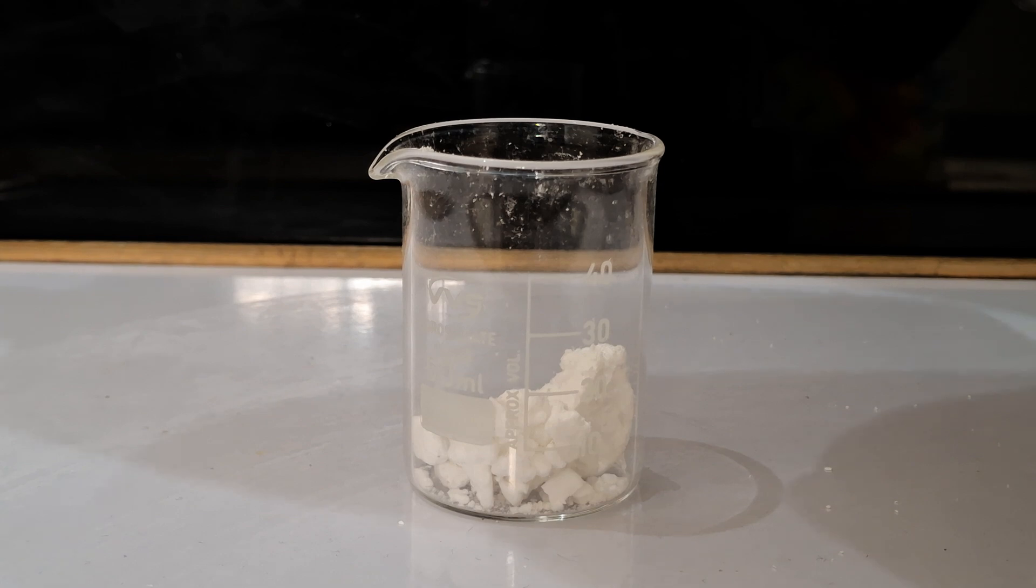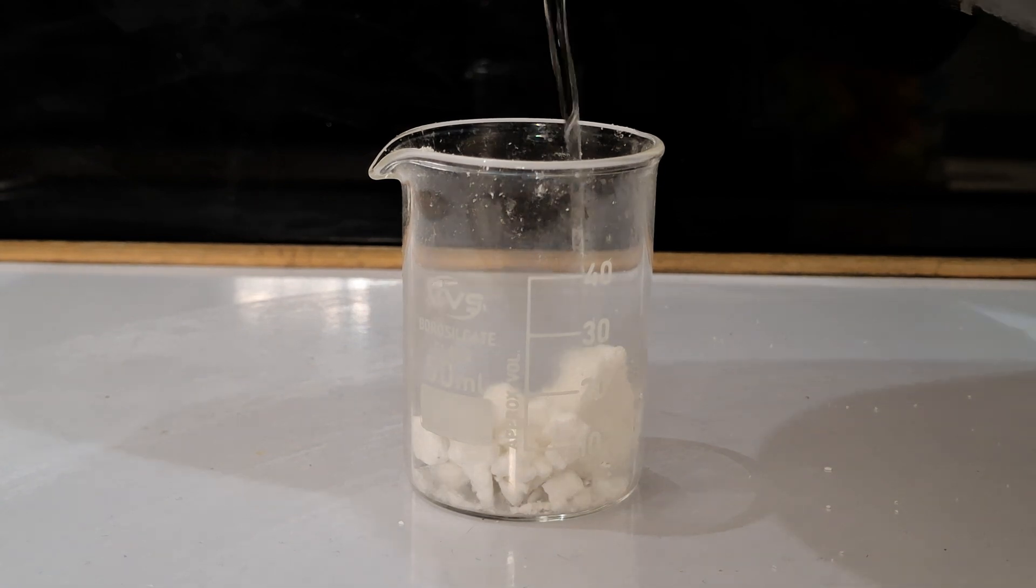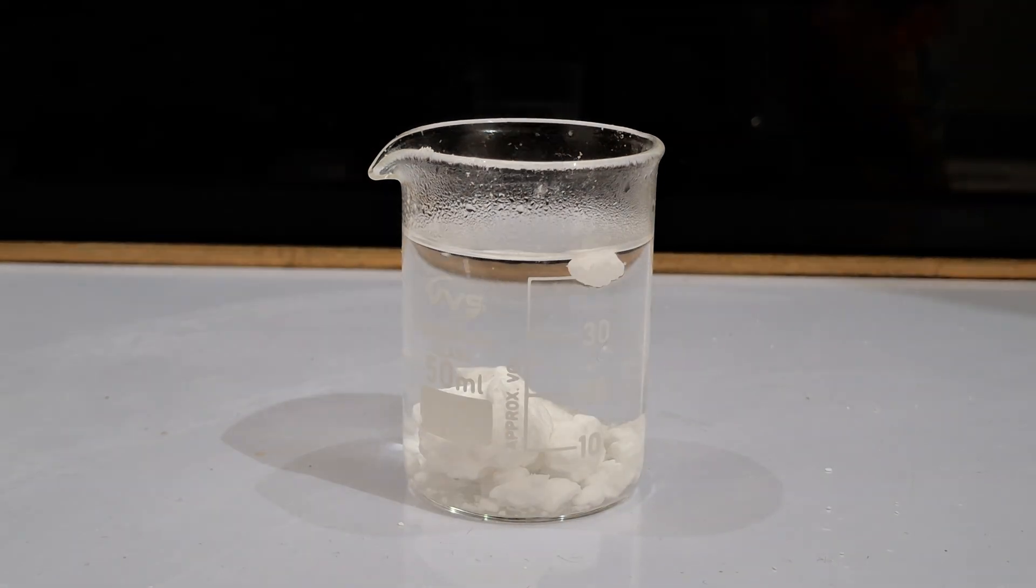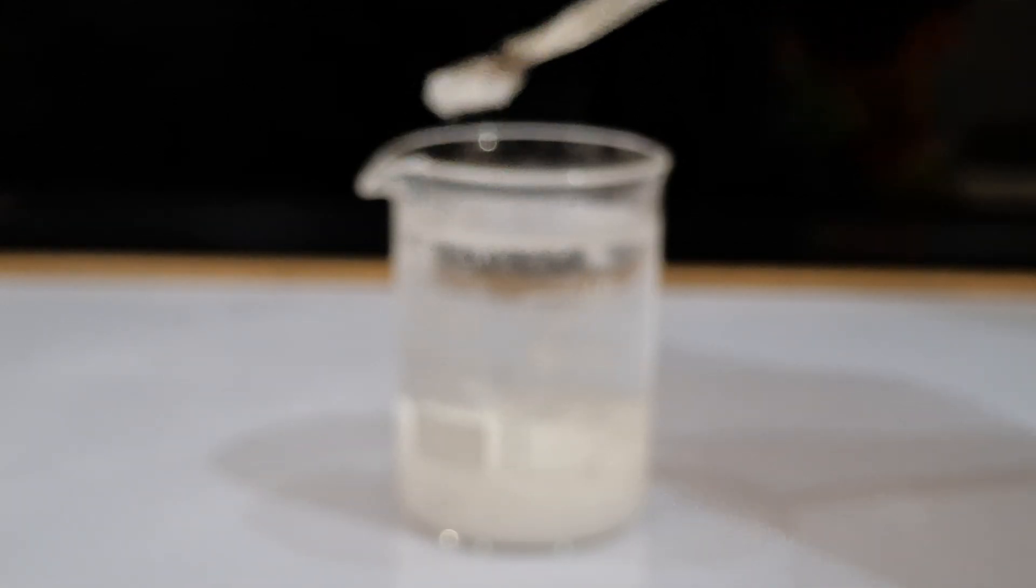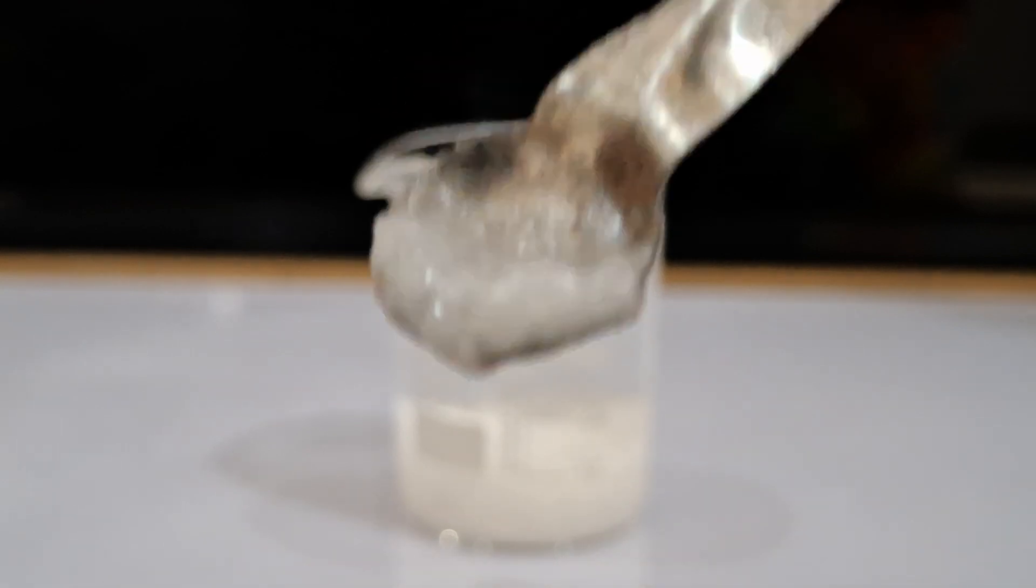Then I move on to recrystallization, where I start by adding hot water to the benzoic acid. After stirring and letting it cool for a while, you can start to see crystals form on the surface of the water.